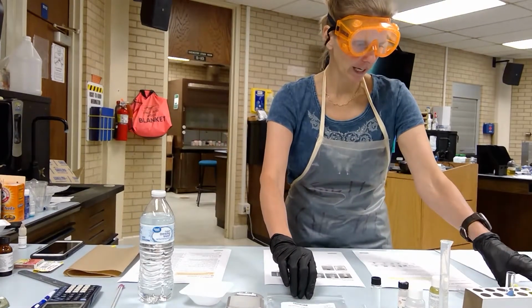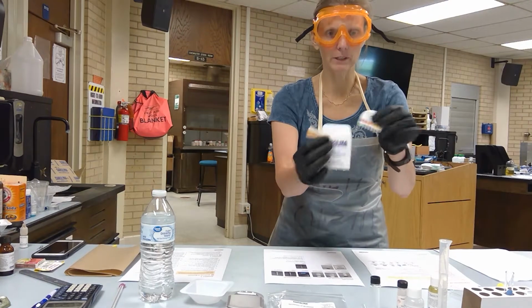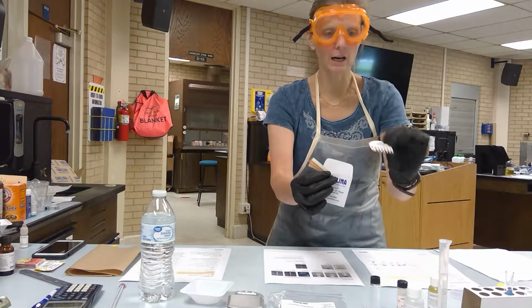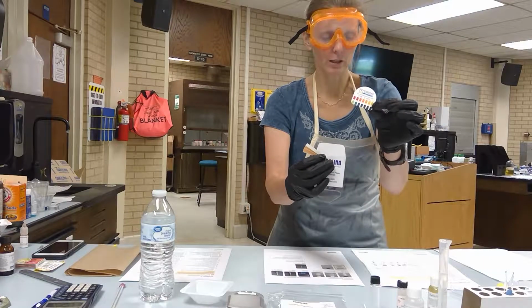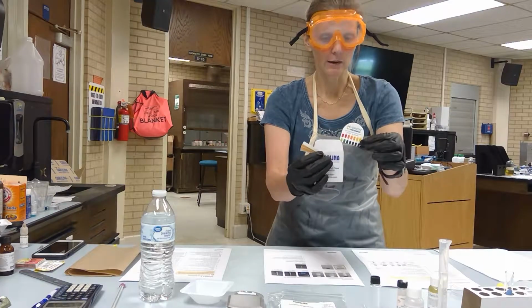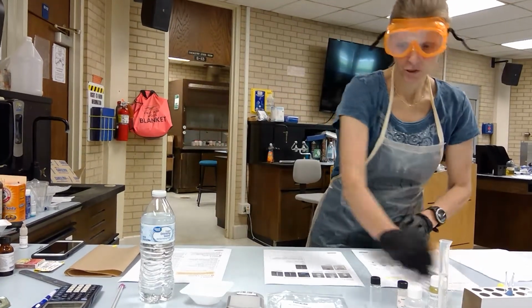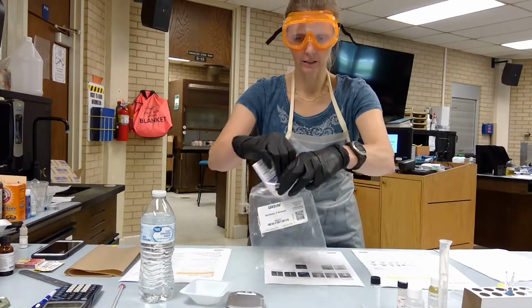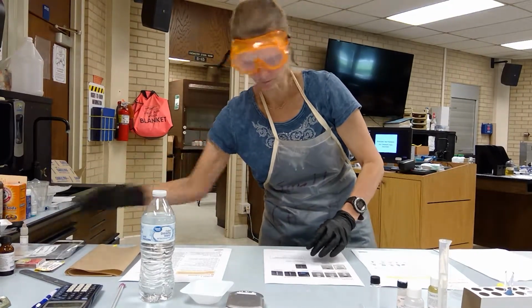One thing I did forget is that in this packet you will have some pH paper, but this will come at a later point in time. This is your broad spectrum pH scale, which will measure one of the tests that you're going to cover later on. You can put that aside until later. We don't want to contaminate our pH paper, so we'll put that over here.